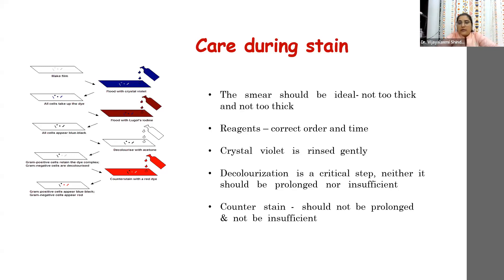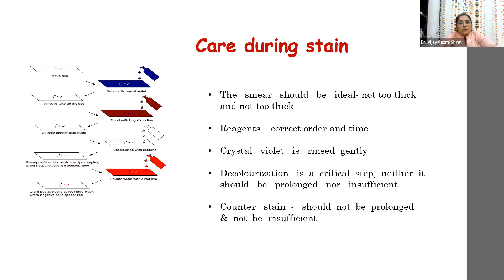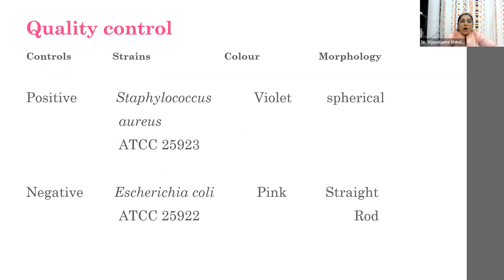Decolorization is a critical step. Too much decolorization will wash away the smear; the primary stain may get washed off. The end point is when the excess visible color on the smear disappears. The counter stain step should also not be prolonged — if you overdo the counter stain after doing the first three steps correctly, you hamper the quality of the smear. All steps, correct order, and timing must be followed properly.